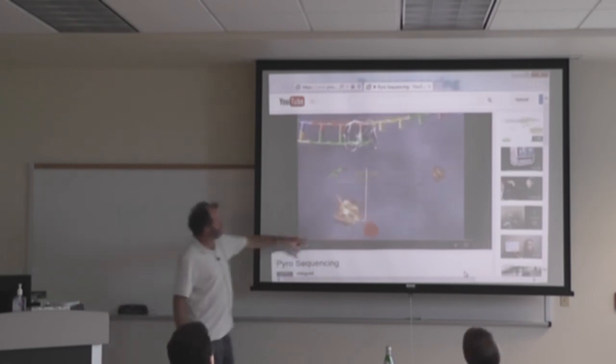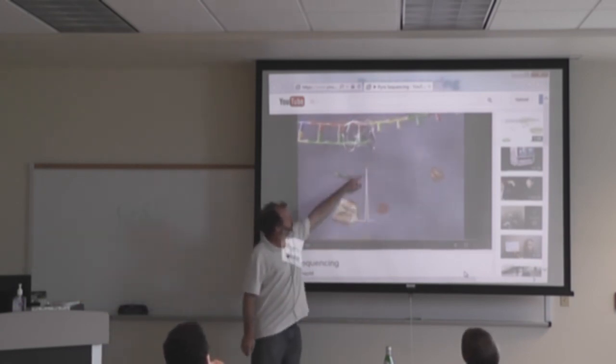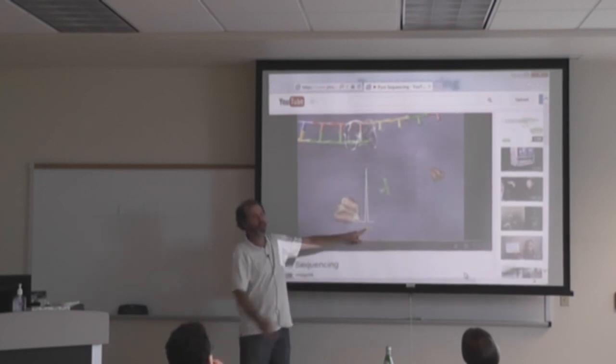So this one was 1G added. Here we get a triple peak, so you know there are 3 A's in that sequence.